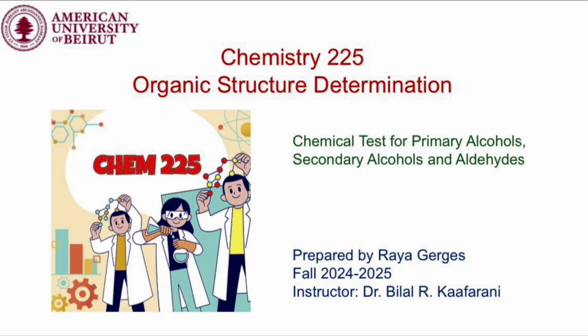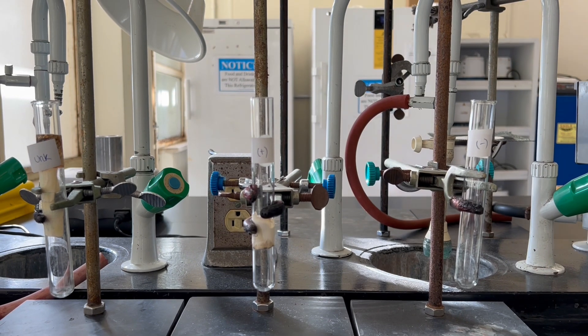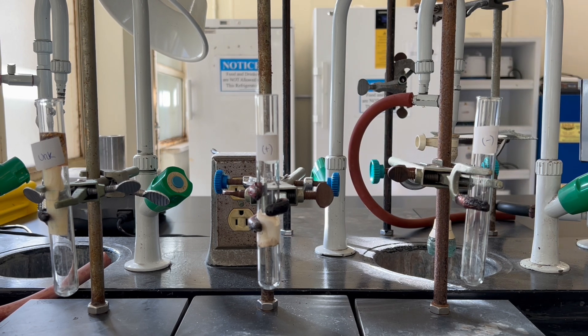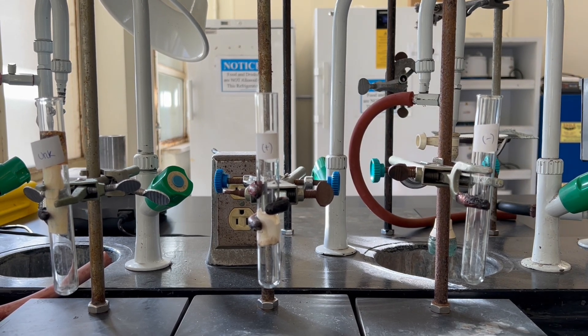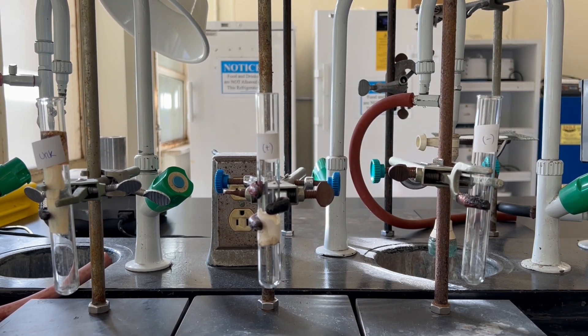Hello, in this video I'll be showing the Jones oxidation test, which is the chemical test for primary alcohols, secondary alcohols, and aldehydes. We have three test tubes: the first one for the unknown, the second one for the positive control, and the last one for the negative control.